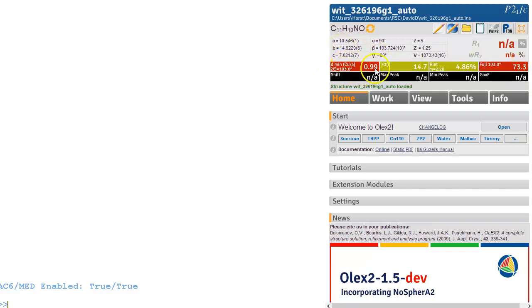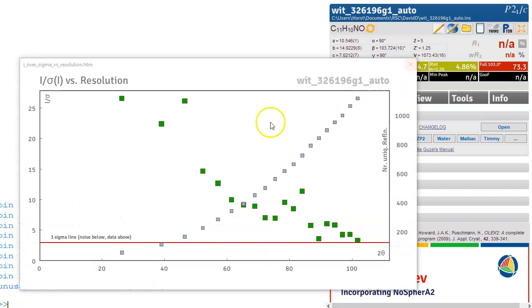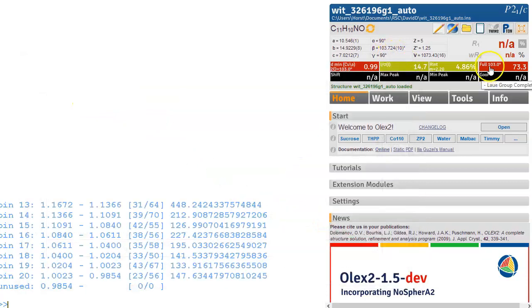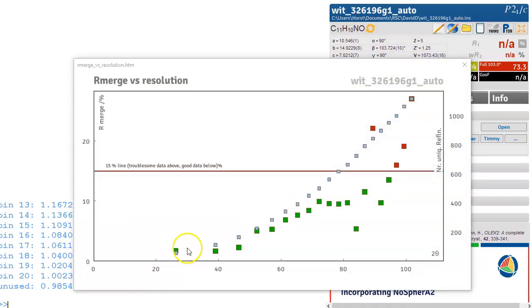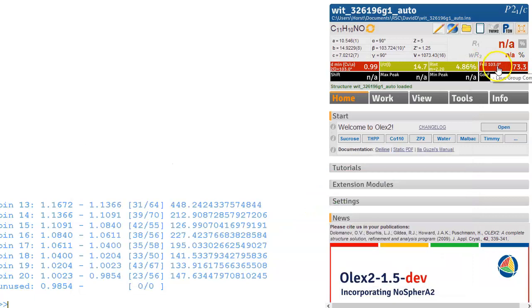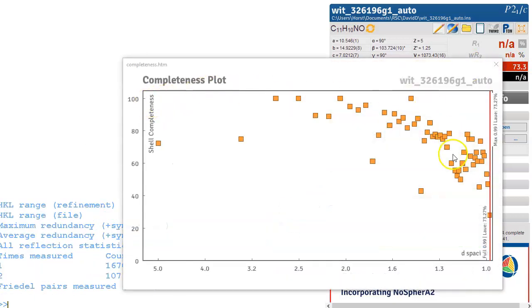So it's copper data set to only one angstrom resolution. That's quite low resolution and we've got an I over sigma of 14.7 so that's quite low as well. We can click on this and we can see the I over sigma as a function of resolution. It's not a very strong data set and we can also look at the rint. It's quite nice and then over here it starts going up into 20% rmerge and the resolution is quite low and we can also look at that completeness.